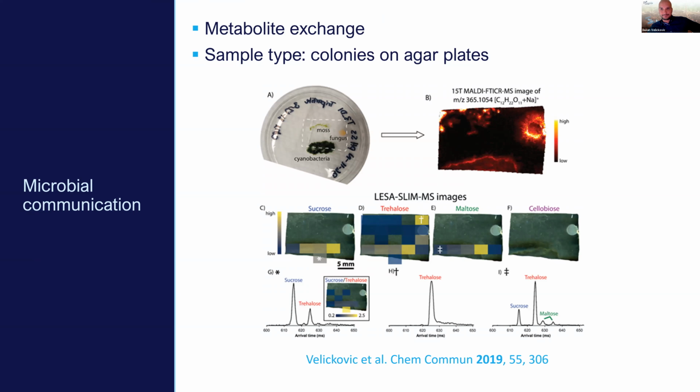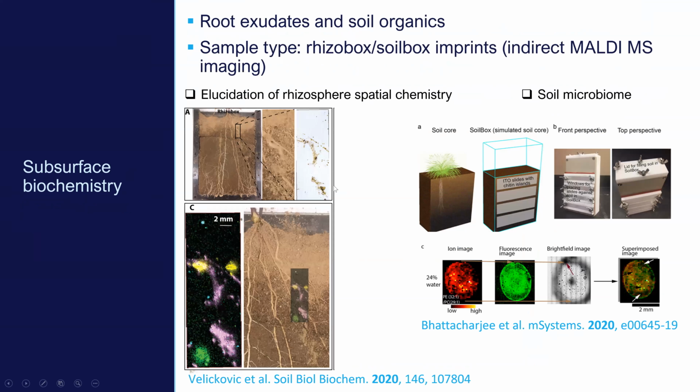Yeah, okay. So for the rhizobox application of the MALDI MS, how long does that, I don't know what to call it, the coating, how long does it need to be exposed to the roots to get a reliable measurement of what's actually there?